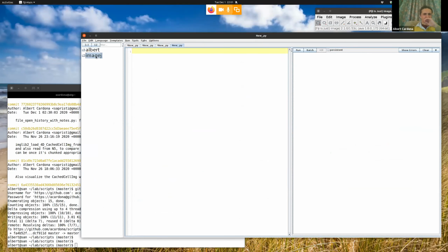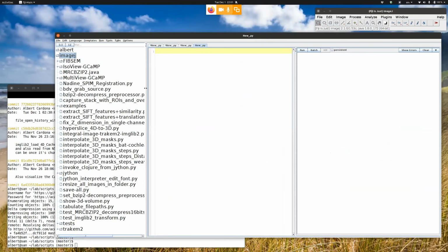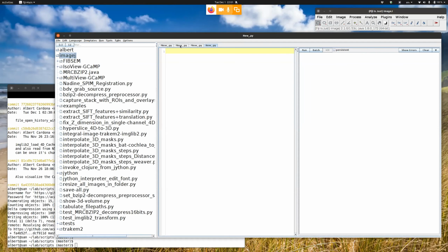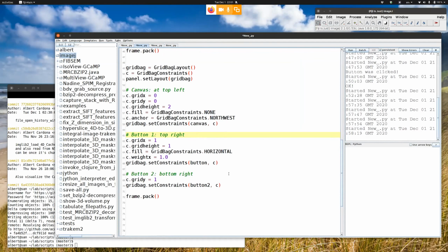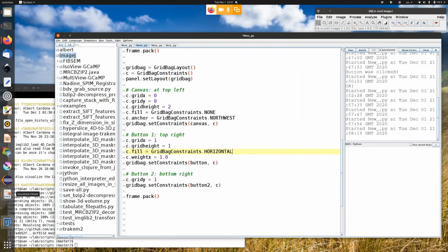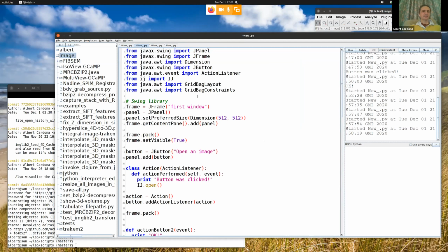So let's see. Sorry, can I just ask something in there? Yeah, go ahead. Whilst we're following you, are we going to be able to have access to some scripts similar to this? Is it on your website, or are you expecting us to sort of follow along and write the code at the same time? If you want these simple scripts that I just typed in, I can save them.